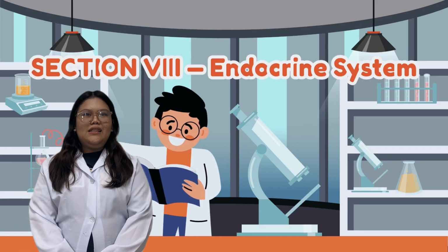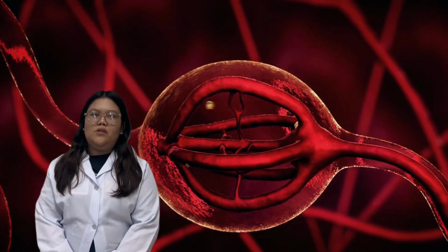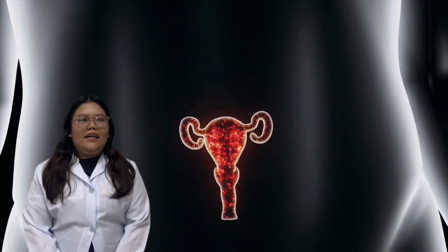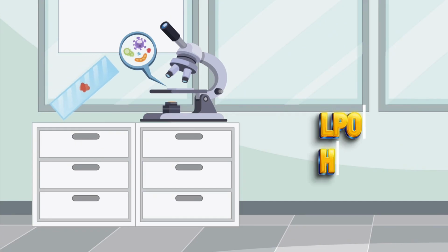Transitioning to the endocrine system, we begin with a brief overview of hormonal control. The endocrine system controls the body through hormones, chemical messengers that travel in the blood and bind to receptors, triggering cellular responses. Negative feedback loops prevent hormonal imbalance and maintain homeostasis. To begin the experiment, using a microscope, place the prepared slides and observe under LPO. Then shift to HPO for confirmation of structure.